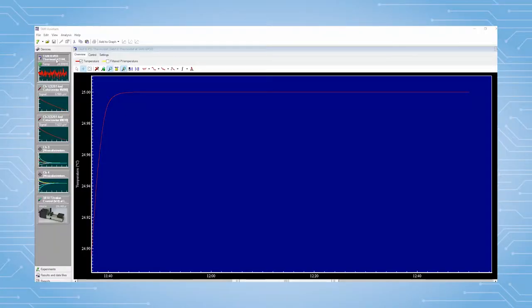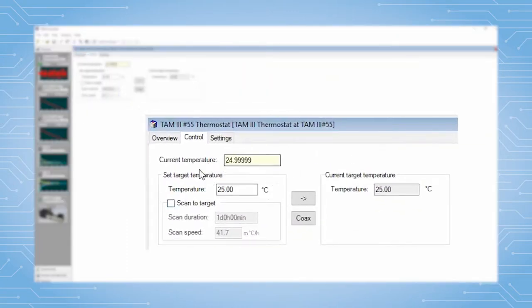Make sure the thermostat temperature is set and stable at the desired experimental temperature. In this example, 25 degrees Celsius.